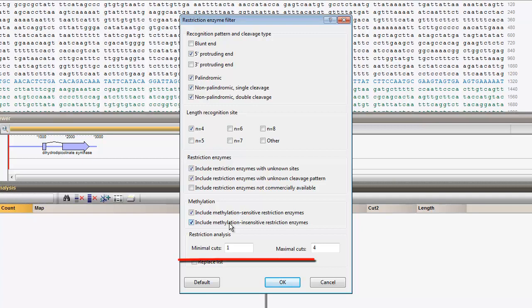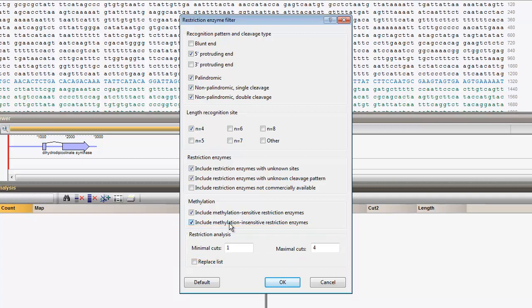In the lower panel, I set minimal cuts to 1 and maximal cuts to 4. I check to replace the list and click OK.